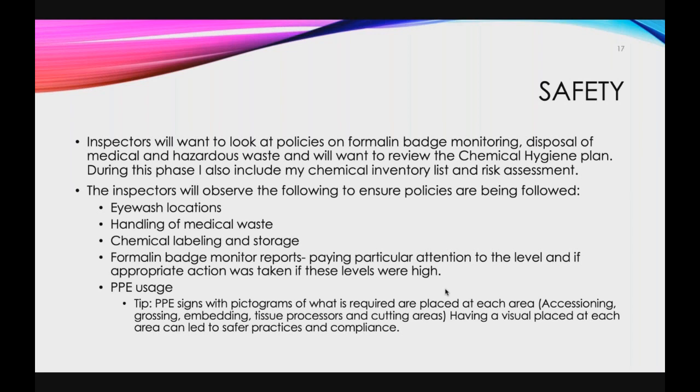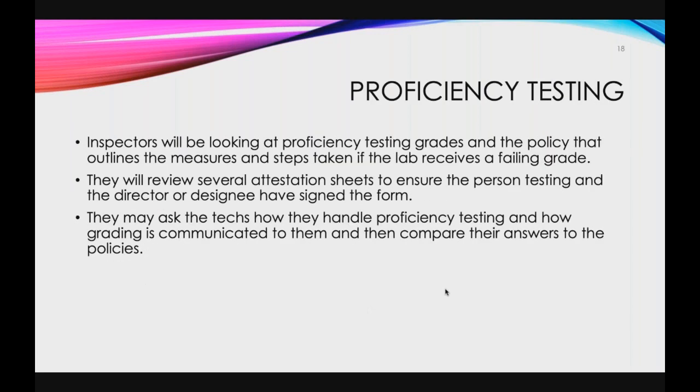And it's very important that they perform it consistently every day, not just during inspection. Make sure that they're following. So if you see them during a normal day, stop them and say, no, listen, we understand there's nothing going on, but this is a daily practice and quality control measure that needs to be followed, and this is the standard of the laboratory. This way, when inspection comes, they're not so worried that they're going to do something wrong, or what are they going to ask me? They're prepared. And safety really is a big portion, and it can get you in pretty tight waters.